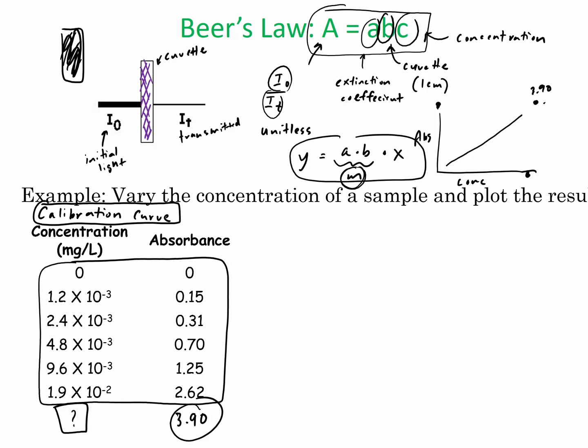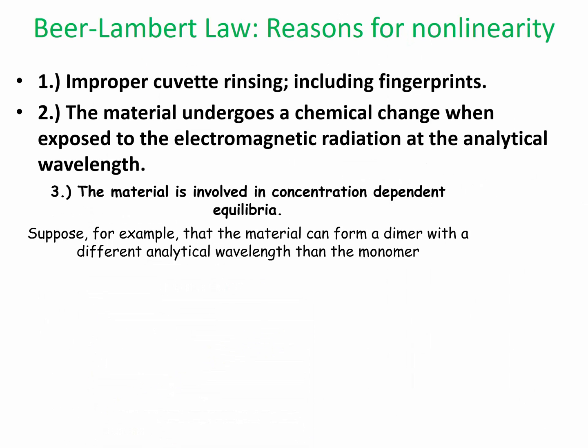What you do is, if you notice that these concentrations from here to here are halved each time when you go up like this. So when you get more and more diluted like that, it's called a serial dilution. And it's a really common lab practice in creating a calibration curve.